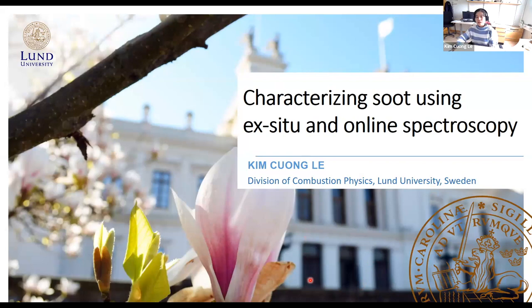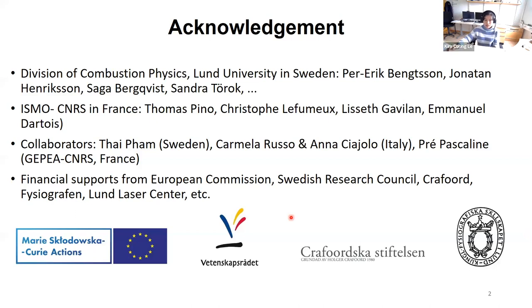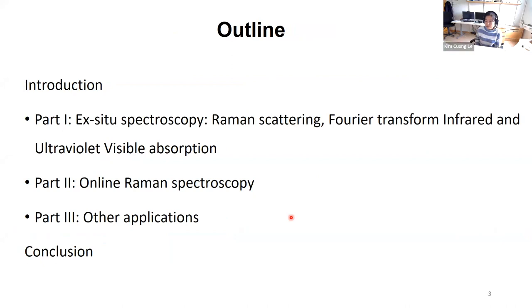Today I will talk about characterizing soot using ex-situ and online spectroscopy. But first, I would like to acknowledge the contribution of my colleagues at Lund University, and also my former colleagues in France, and some collaborators from Sweden, Italy, and France, as you can see their names here. And of course, it's very important to have financial support from many different funding agencies for my research. In this presentation, I will talk about three main contents. The first one is the ex-situ spectroscopy, including Raman, Fourier transform infrared, and ultraviolet absorption. And then I will move to the online technique, particularly the online Raman technique, and then some other applications.